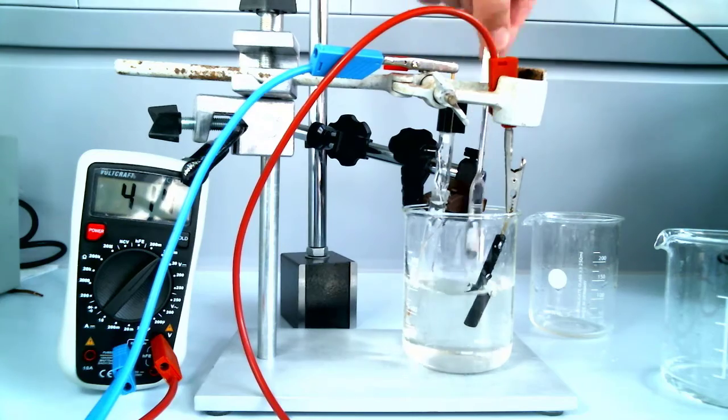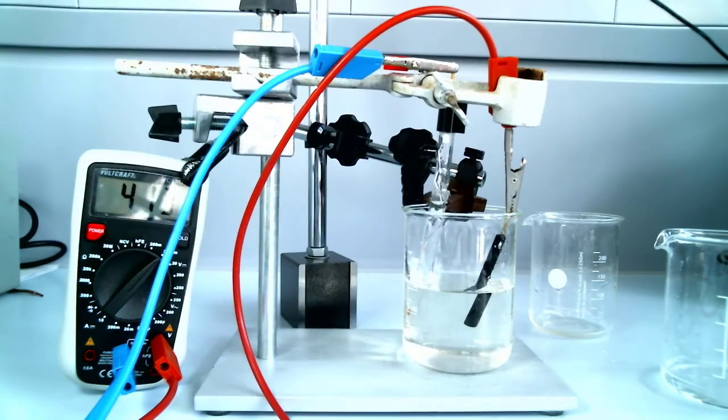Now we've got a fixed redox potential caused by the solution. So here we're fixing the redox potential using the solution and not using a power supply. We could use a power supply to vary the redox potential. That's the other way to do it. Now we add the complexing agent.